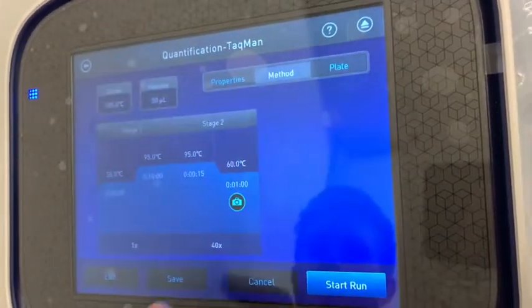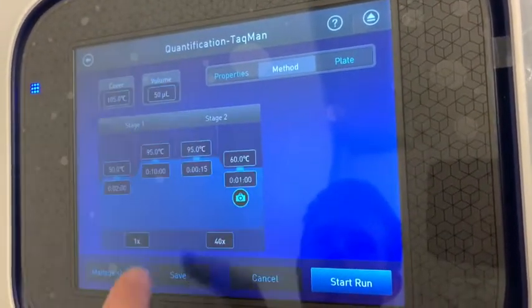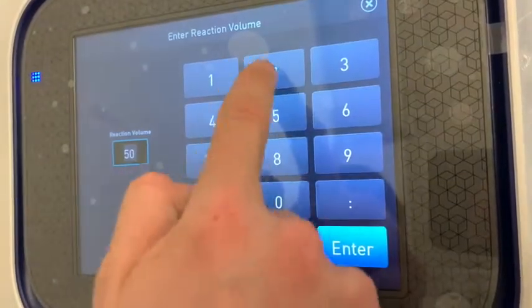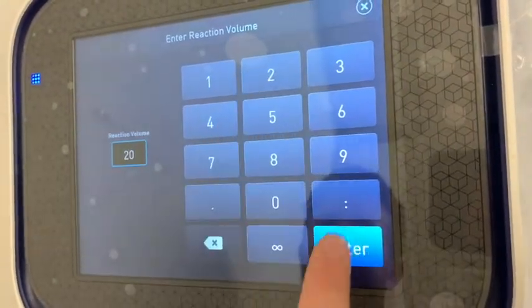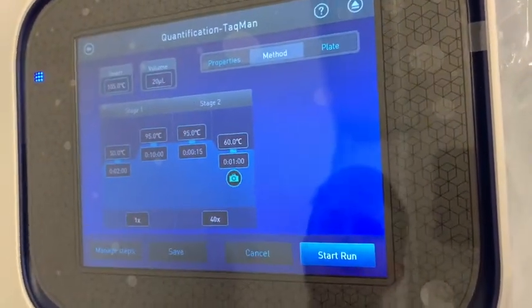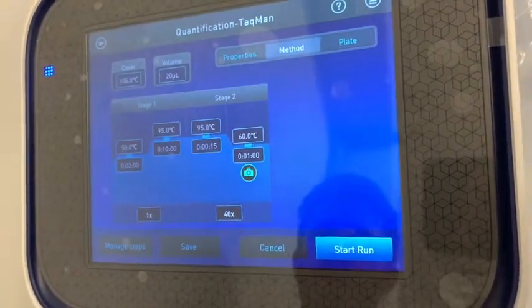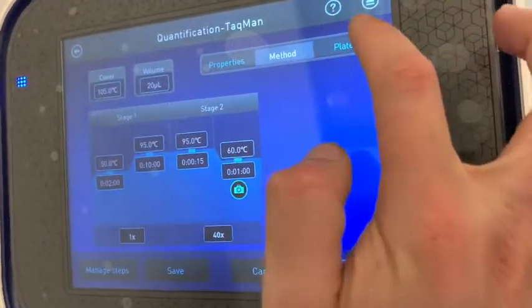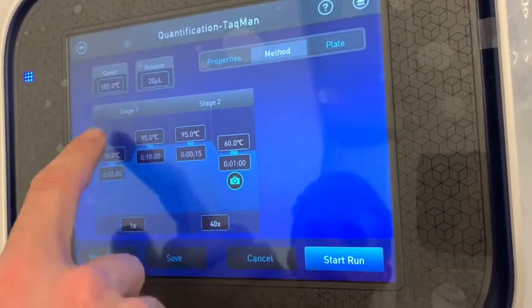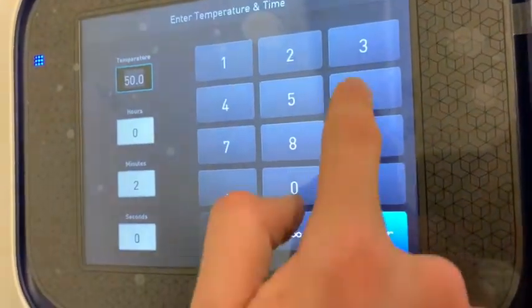Go to Method. Install the method according to the settings in the Phoenix Multiplex instructions for use, page 10: 20 microliters for 96 wells and 10 microliters for 384 wells. The values here should also be adjusted according to the Phoenix IFU.